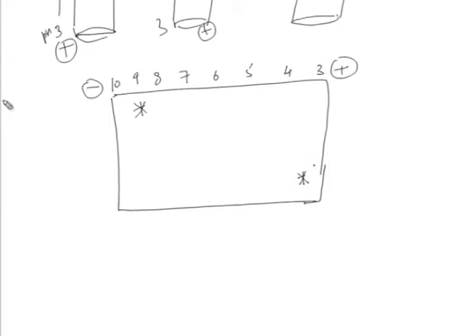If the protein pI is, say, around 6, then this will migrate towards this side and this will migrate towards this side, and finally, they will settle down at pH 6, or they will focus at a particular pI value.